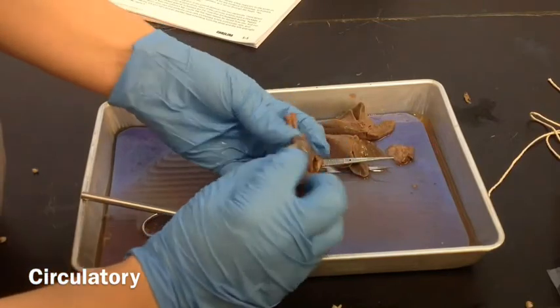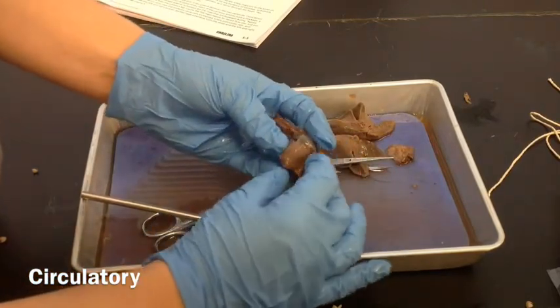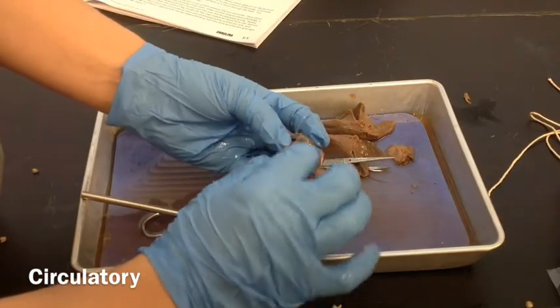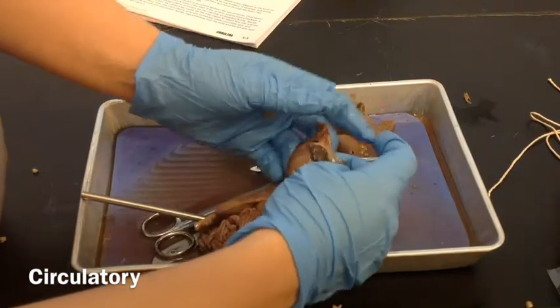You see this plastic — it almost looks like a plastic sack that was surrounding the heart. That's called the pericardium sack. We already cut that open, and we can pull that back so we can see the heart.